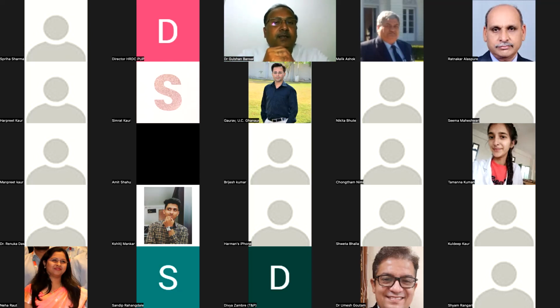Actually, sir, we are also applying higher temperature to the column. Let's say in HPLC we are looking at 50 degrees, 70 degrees Celsius. Now, at that temperature, of course, when we work at the higher temperature, the life of the column is compromised, no doubt about it. But it is not like they will start bleeding immediately.